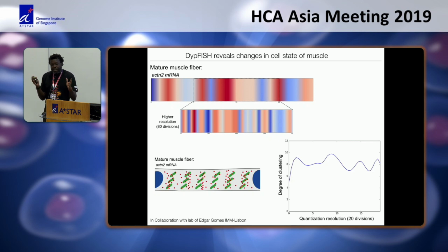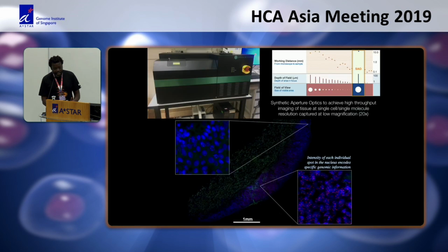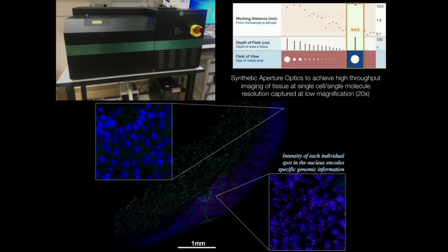That if we did single cell RNA-seq, we wouldn't actually be able to see this because the number of RNA molecules is essentially the same in these 2 different conditions. And we control that with GAPDH. So in the future, what we see here is that we need technologies that allow us to do this at very high bandwidth. And high bandwidth means like in tissues, but with single cell resolution, which is something that we're working on extensively in our laboratory.